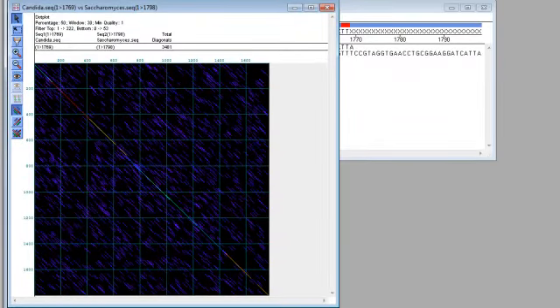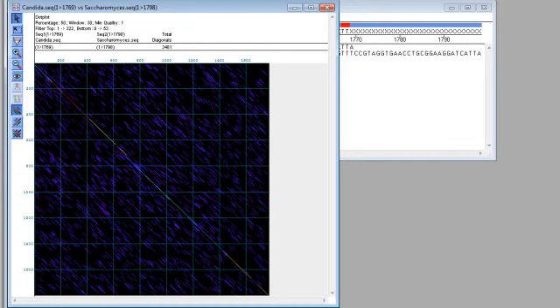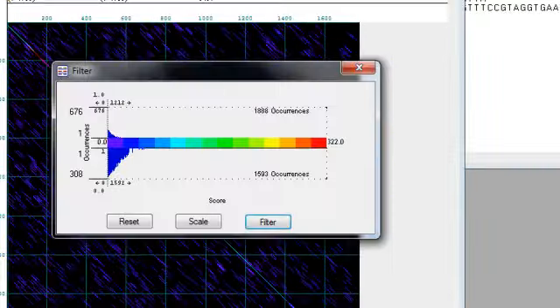To see another view of the distribution of alignment scores, I can use the filter palette tool. So I'll click that.